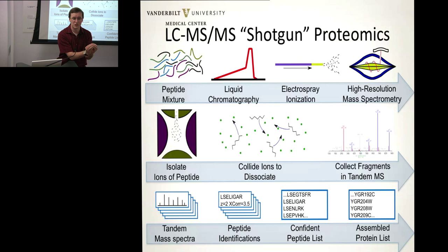So by scanning those out to a tandem mass spectrum, we produce the fingerprint, basically, for this particular peptide in a single tandem mass spectrum. And the mass specs can do that very fast. Even an instrument at the age of the LTQ, which is, I think, something like 5 years old now, maybe 6 or 7, actually, you can produce 10,000 of these tandem mass spectra in the space of about 90 minutes. So ostensibly, you could identify 10,000 different peptides in a single experiment.